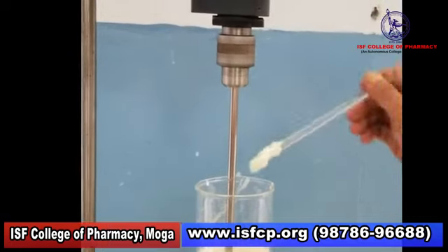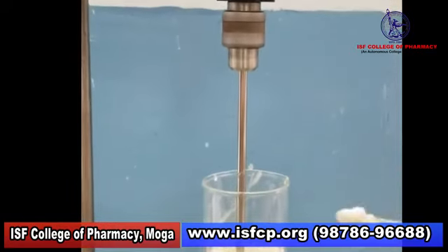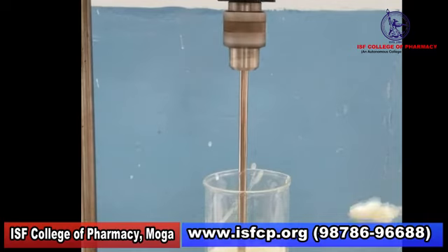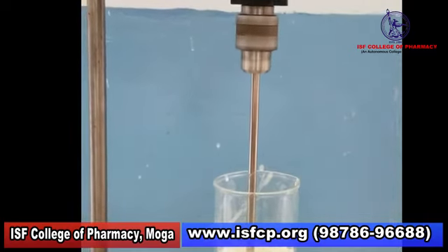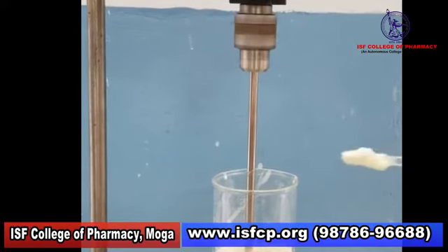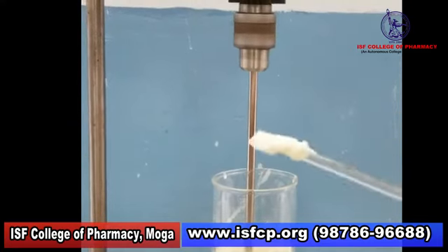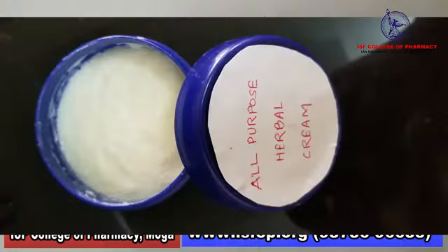Now you can see the cream is ready. After the stirring, which was continued for 40 minutes, the temperature of the system is reduced to 50 degrees. When the temperature reduced, we put the lavender oil into the cream, and the stirring was continued for 5 minutes. Now you can see our cream is ready. We poured the cream into the container. It has a very smooth consistency, free from grittiness, and a very smooth viscosity.